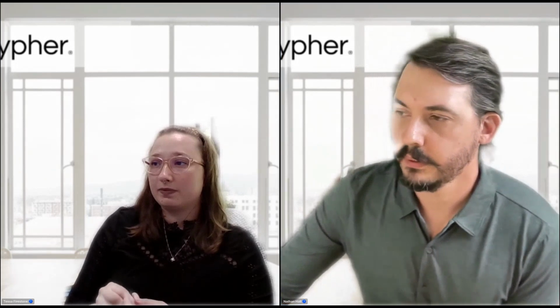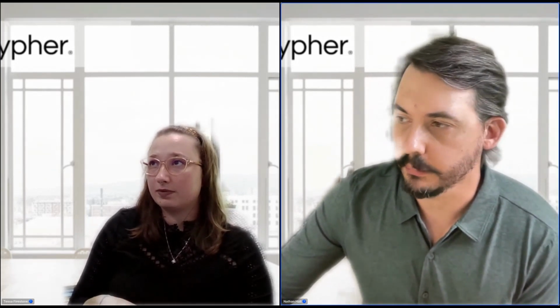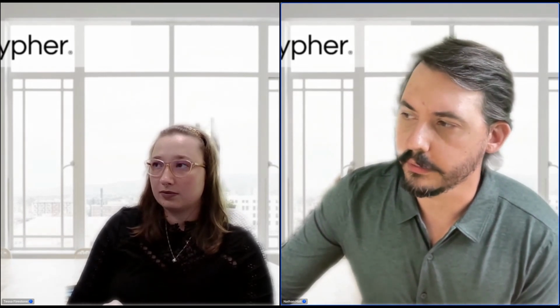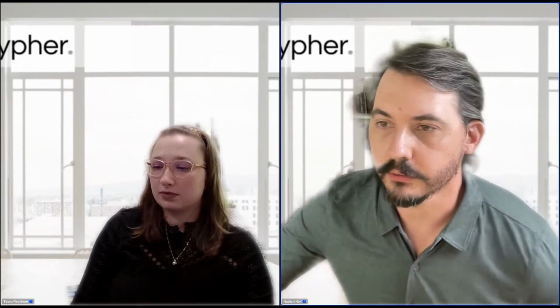Okay. All right, last question here. Again, we're going to answer any question we didn't get to via email. Would repressive histone marks be harder to target than active ones due to accessibility? We have been able to map a wide range of targets, from K9 trimethyl, which is heterochromatin, and K27 trimethyl. We've been able to map those in CUT&RUN. So there's really no limit between facultative heterochromatin and constitutive heterochromatin in terms of CUT&RUN.